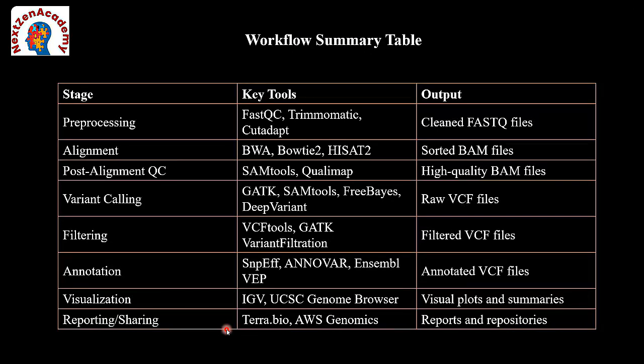So this is all about the complete final step of the whole genome sequencing, that is, next generation sequencing. Here is the pakka work table where you can explain the different stages, the different tools, and the different outputs you can get. I'll explain how the pipeline works. So far, theoretically, you can see how everything is happening.